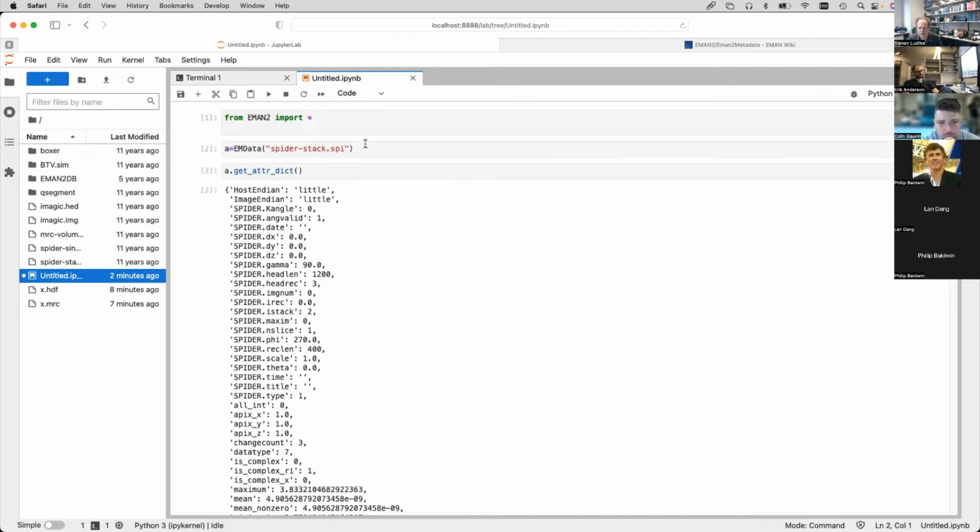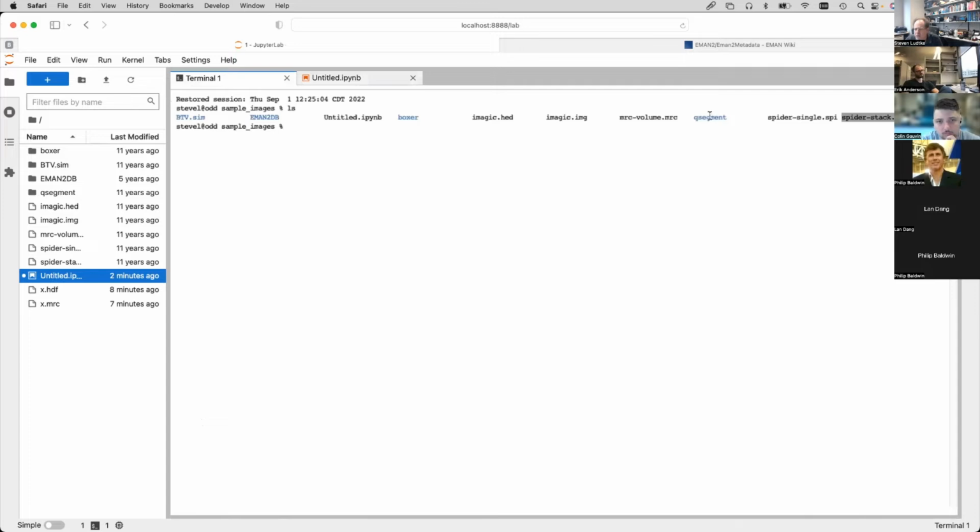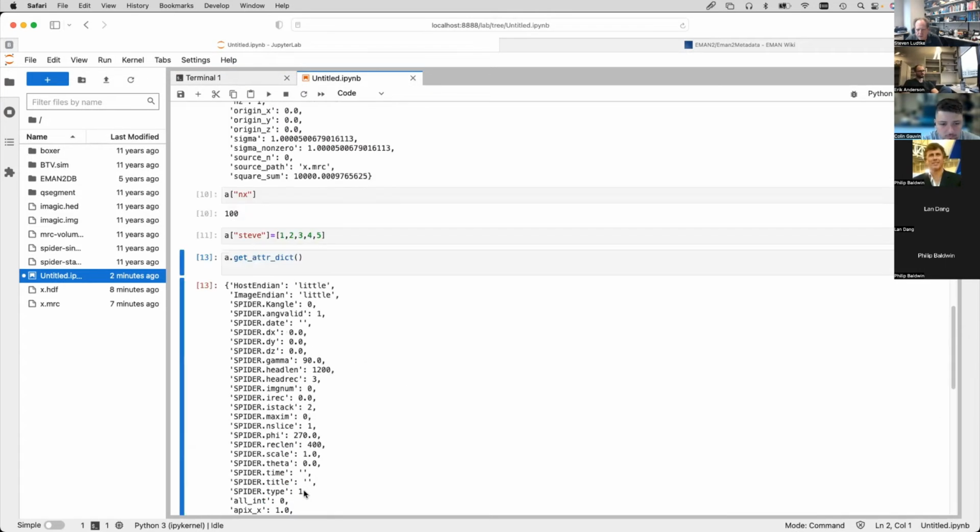So let's see, I think we should have a volume. Yeah, here we've got an MRC volume. So let's read that volume in as a volume.